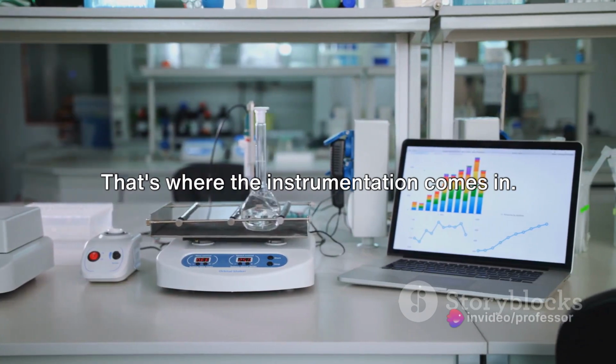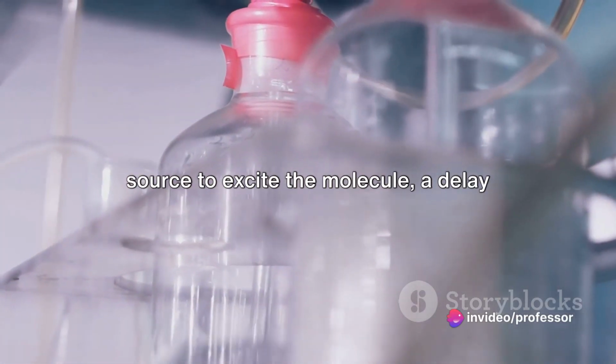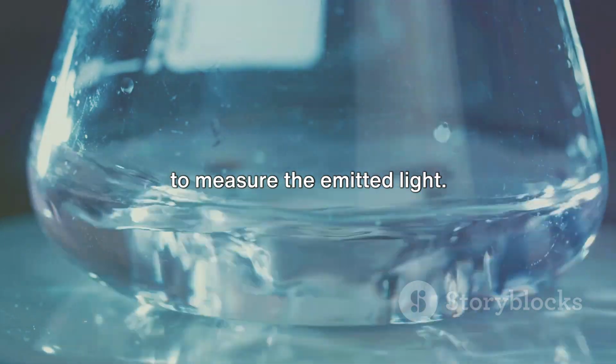That's where the instrumentation comes in. The core components include a light source to excite the molecule, a delay mechanism to pause between the excitation and emission measurements, and a detector to measure the emitted light.